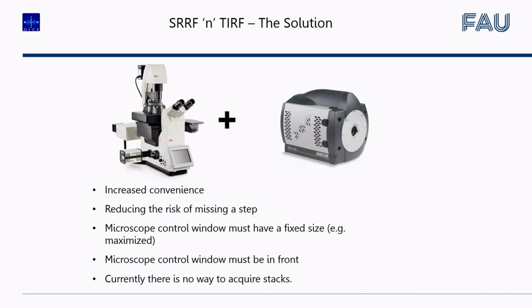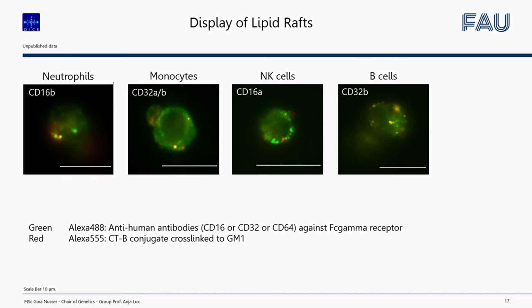The microscopy control window must have a fixed size. I mentioned that, and it must be in front. And currently, I have to admit, we are not able to acquire stacks. And I will show you a few examples from groups working at my institute and utilizing this technology.